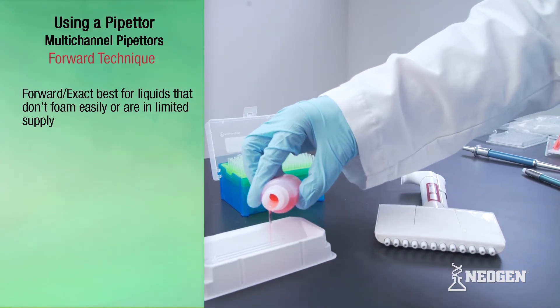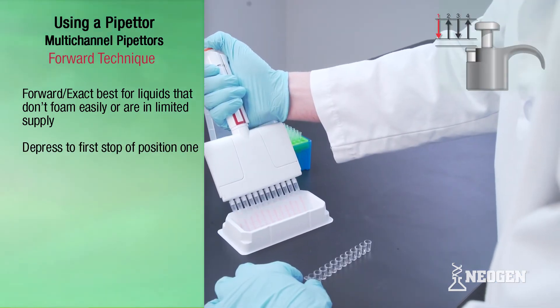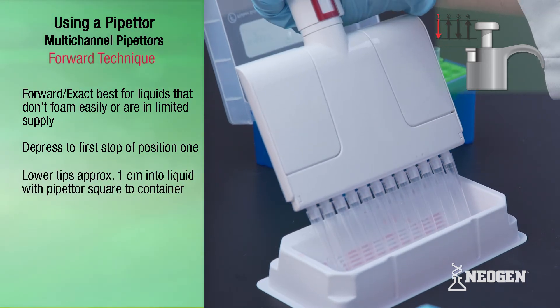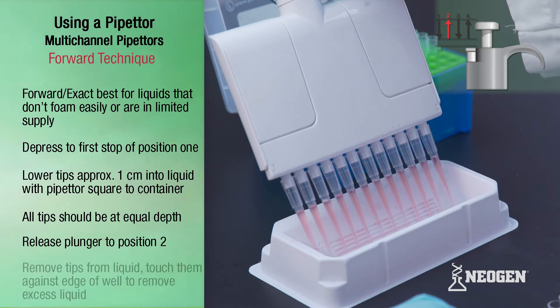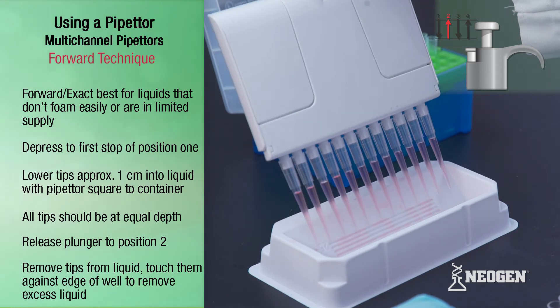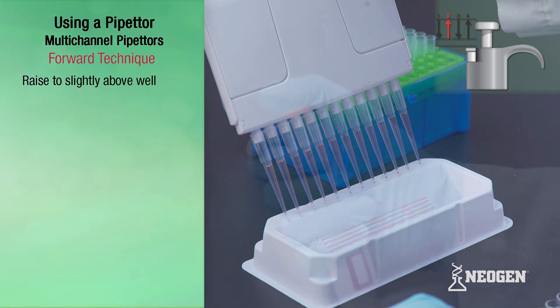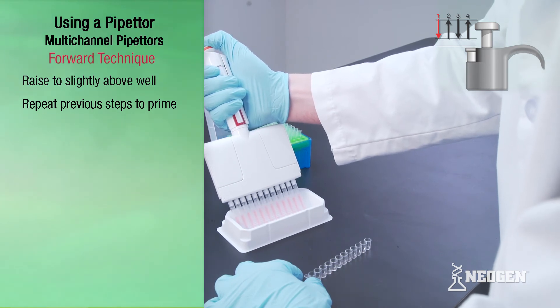The forward or exact technique is good for pipetting liquids that do not foam easily or that are in limited supply. Depress the plunger to the first stop of position one. Lower the pipetter so that the tip is placed under the surface of the liquid in the wells or reagent boats to about one centimeter, with the pipetter square to the wells or reagent boats so that one side of the pipetter is not higher or lower than the other side. Slowly release the plunger to position two — this action fills the tips. Withdraw the tips from the liquid, touching against the edge of the container to remove any excess liquid. Slightly raise the pipetter so that the filled tip is just above the remaining liquid, and repeat these initial steps to prime the tips, which ensures equal volumes of liquid are drawn and dispensed.